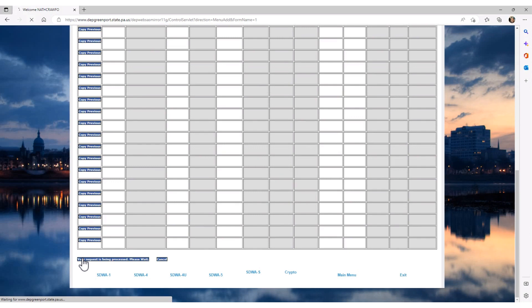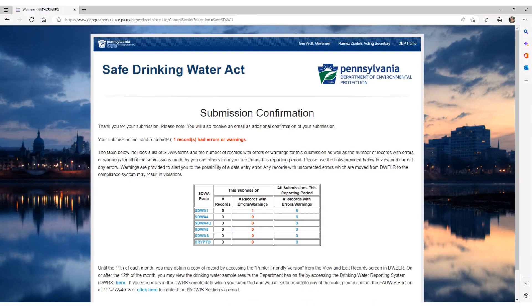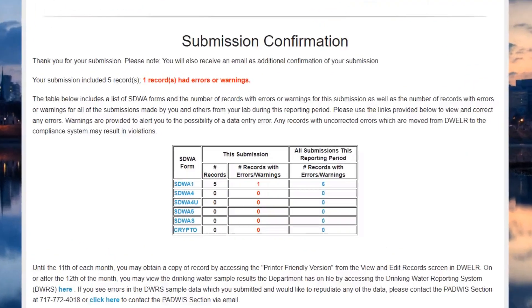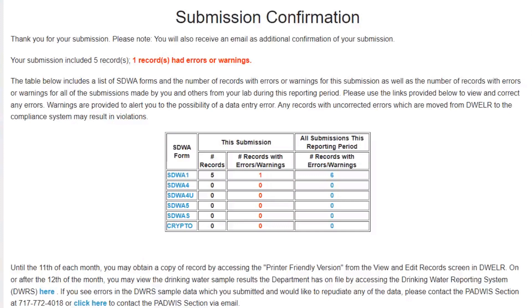Clicking multiple times will cause duplication of data submitted. After your data has finished compiling and is submitted to DWELLR, the Submission Confirmation screen appears. The first thing to notice is the second line, which identifies that your submission included five records, and that, displayed in red text, there is one record with an error or warning. A table is provided which will further help break down the submittal for you to ensure the accuracy of the data entered into DWELLR.